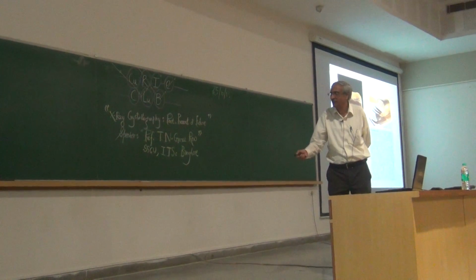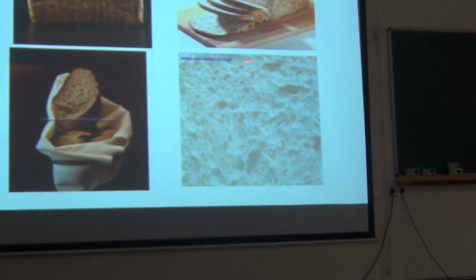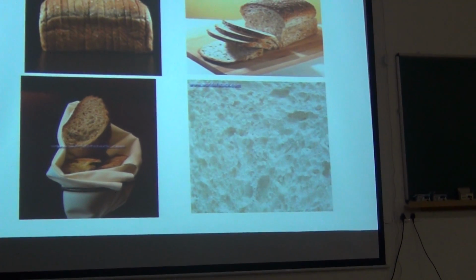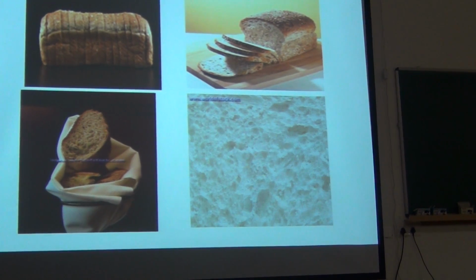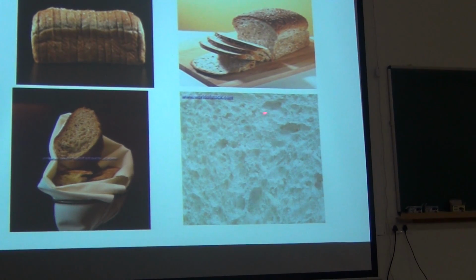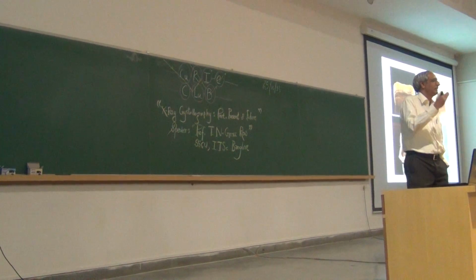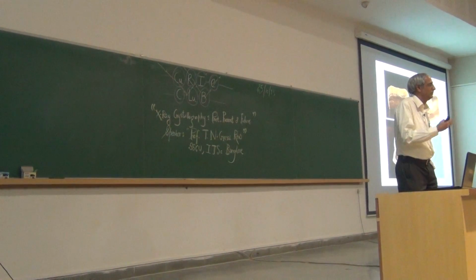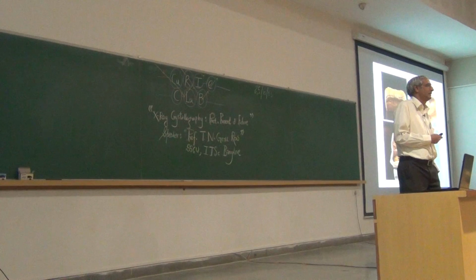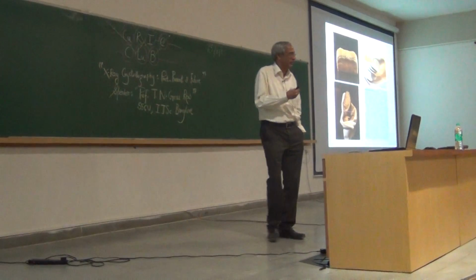So when you send an X-ray beam, you will get X-ray diffraction from this plane following Bragg's law. But what actually diffracts the X-rays is not this particular plane. The reflection is coming from the plane, but what is diffracting is the contents of this plane, the cashew, badam and other things, which are now the atoms associated with this plane. So there will be some planes in which there are no pieces of badam, and those planes will not give you enough intensity. They will give some intensity but not strong enough. So the stronger the content of this particular slice, the more we will see.